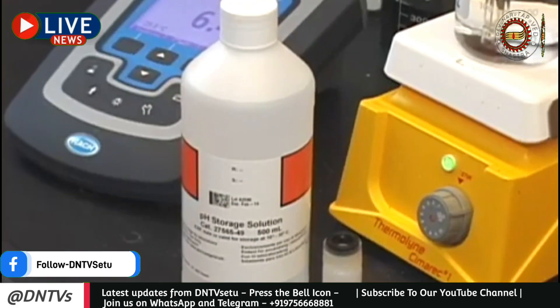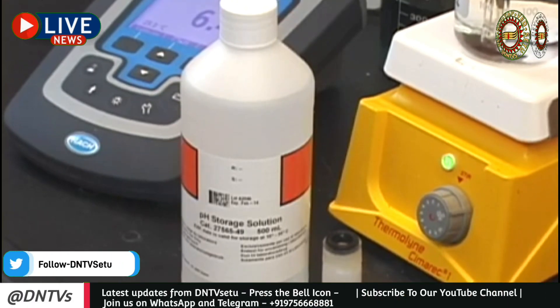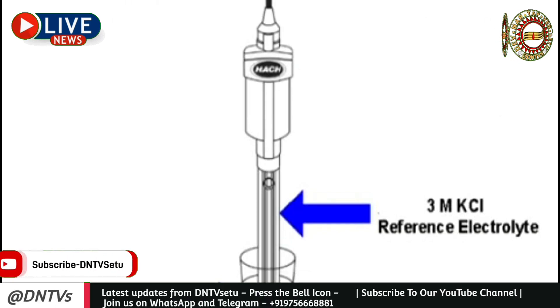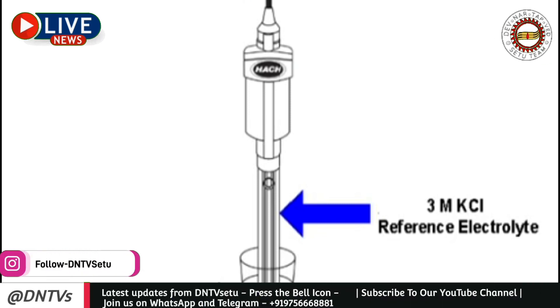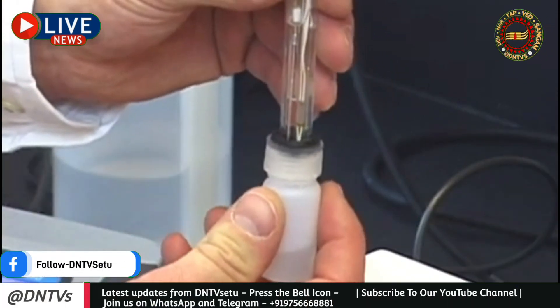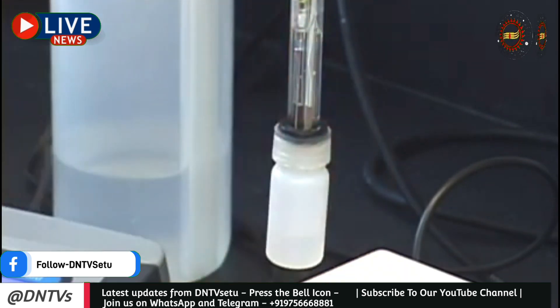Now that we have calibrated and taken a reading, let's talk about how to store your electrode. Proper storage extends the life of your electrode and ensures it's ready to provide quick and accurate readings in the future. Storage solutions do a couple of things to improve the effective life of your electrode: the solution is similar to what is inside the electrode, which helps prevent contamination of the internal filling solution — especially important with non-refillable electrodes where we cannot replace the filling solution. It also ensures your electrode is hydrated and immediately ready for use. Never use anything low in ionic strength, like deionized water, as it will change the internal filling solution concentration and shorten the life of your electrode.